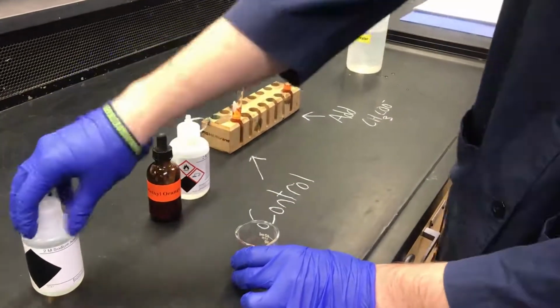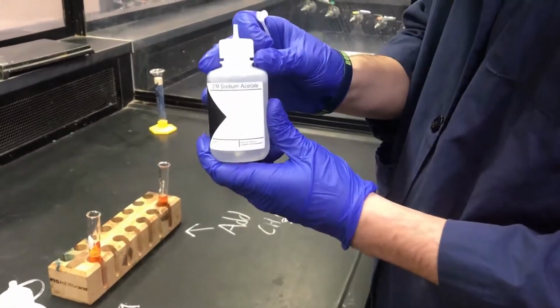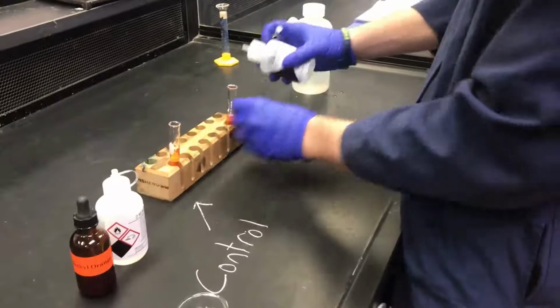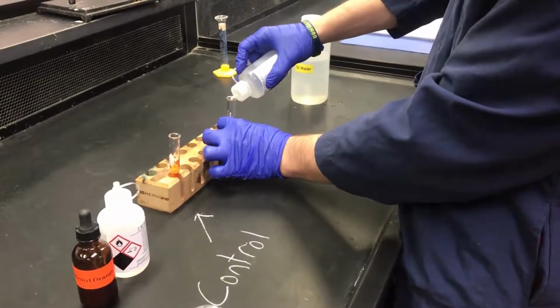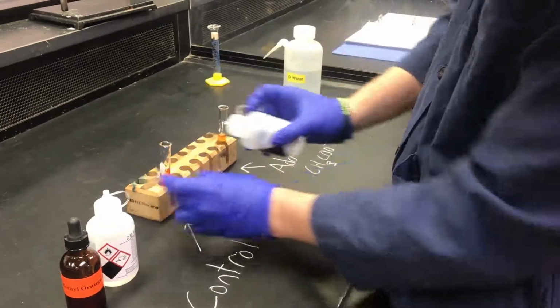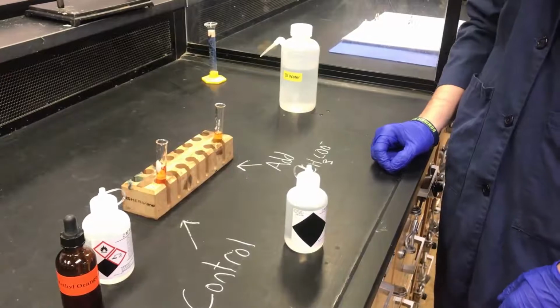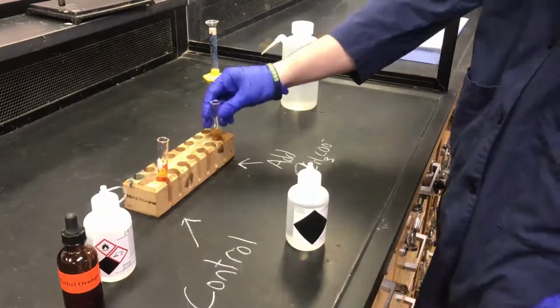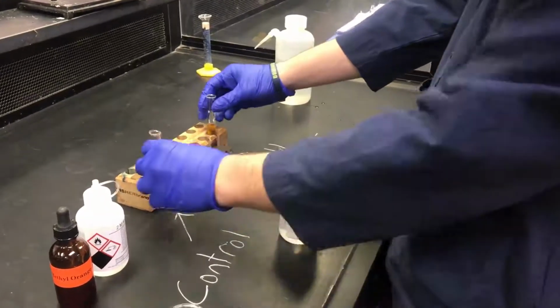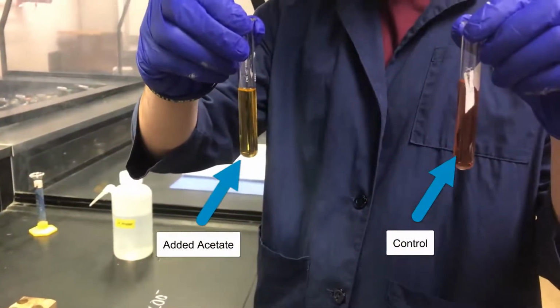So we have our control, which we won't do anything to. And then to our second test tube, we're going to add 5 drops of 2 molar sodium acetate. Don't worry, we didn't add any drops there. And now you can see the color change. We added the acetate and it turned yellow compared to the orange control.